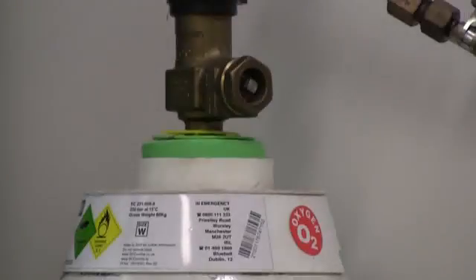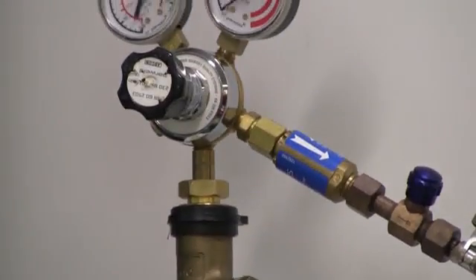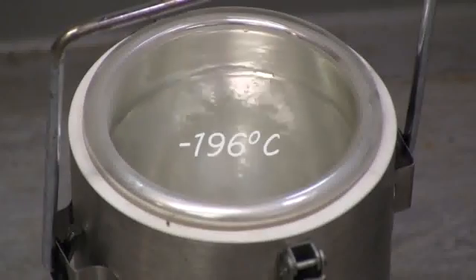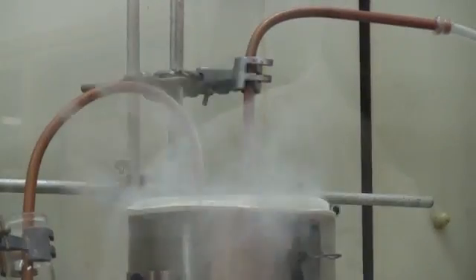First, we have to make the liquid oxygen. We have here a tank of pressurised oxygen gas. This condenses at minus 182 degrees Celsius. By passing it through this copper coil, immersed in liquid nitrogen at minus 196 degrees Celsius, the oxygen will condense into a liquid which we will collect in a tube.